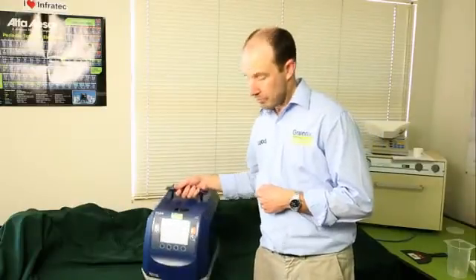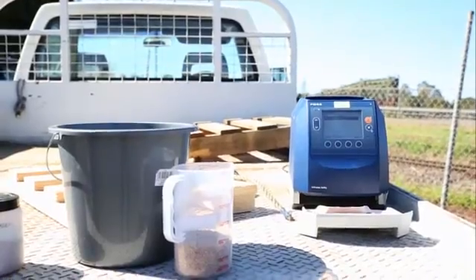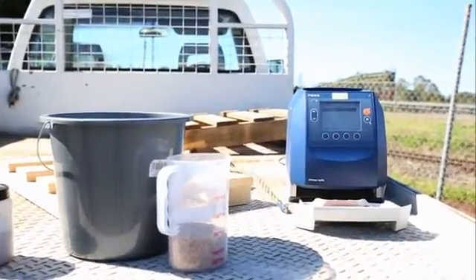The FOSS Sophia is portable, it runs off either mains power or 12 volts DC, and it comes with a hard road case to keep it safe.